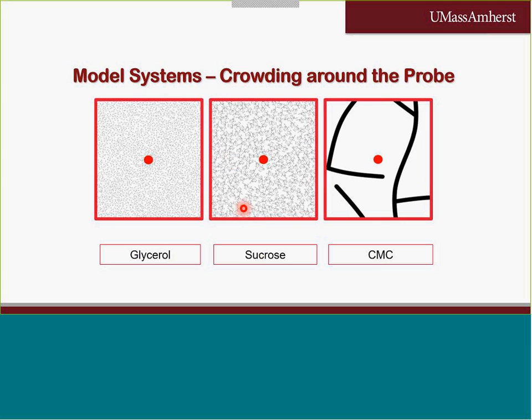When we have a hydrocolloid, the probe sits in a highly complex network where we basically sense the water that is being retained by the network itself, and not the walls and the structure of the shell that is being formed. So, local sensitivity reports basically on water instead of the overall environment. So there is a discrepancy between what happens at the local level and at the bulk level.